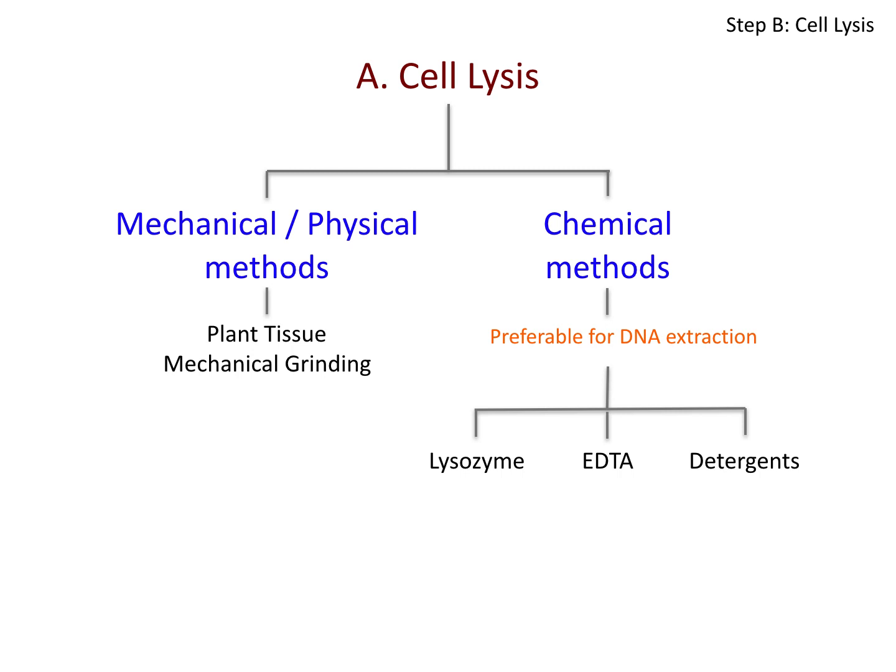Researchers may put together 2 or 3 chemicals, out of which one attacks the cell wall and the other the plasma membrane, or they may use a combination of both physical and chemical methods for cell lysis depending upon the organism that is being investigated. Following cell lysis, the broken fragments of cell wall and plasma membrane that are left in the cell extract are collectively known as cell debris. So at last, the cell debris is removed and only a clear solution of the remaining cellular components is taken forward for the next step.